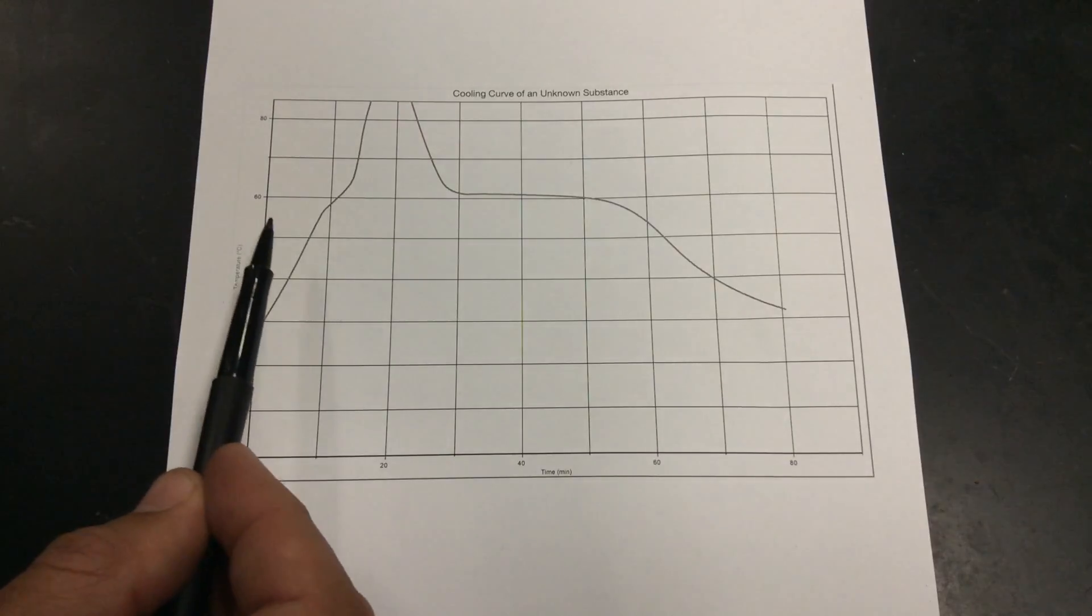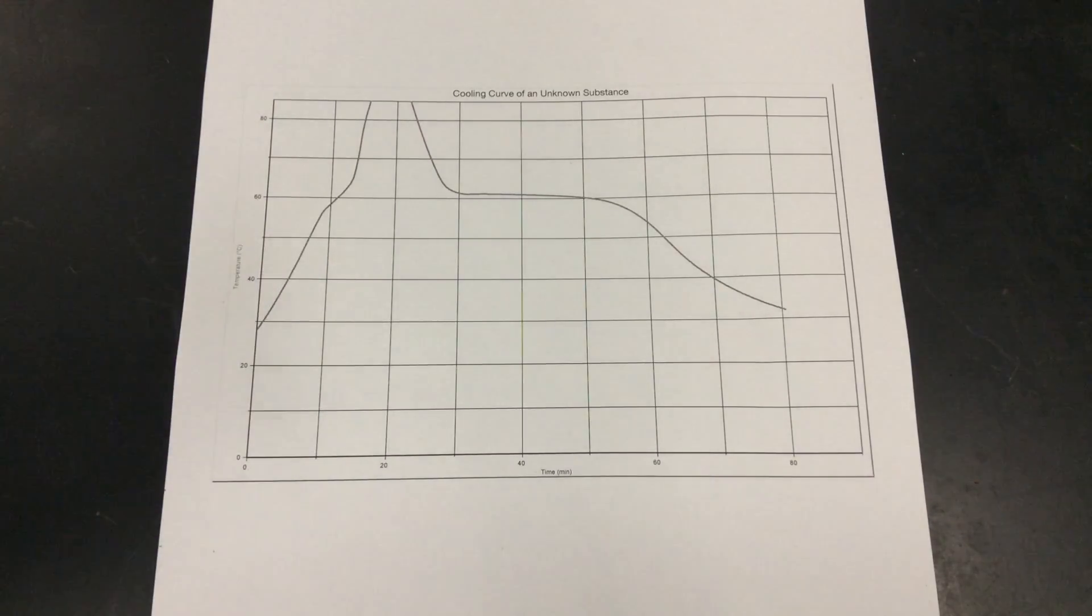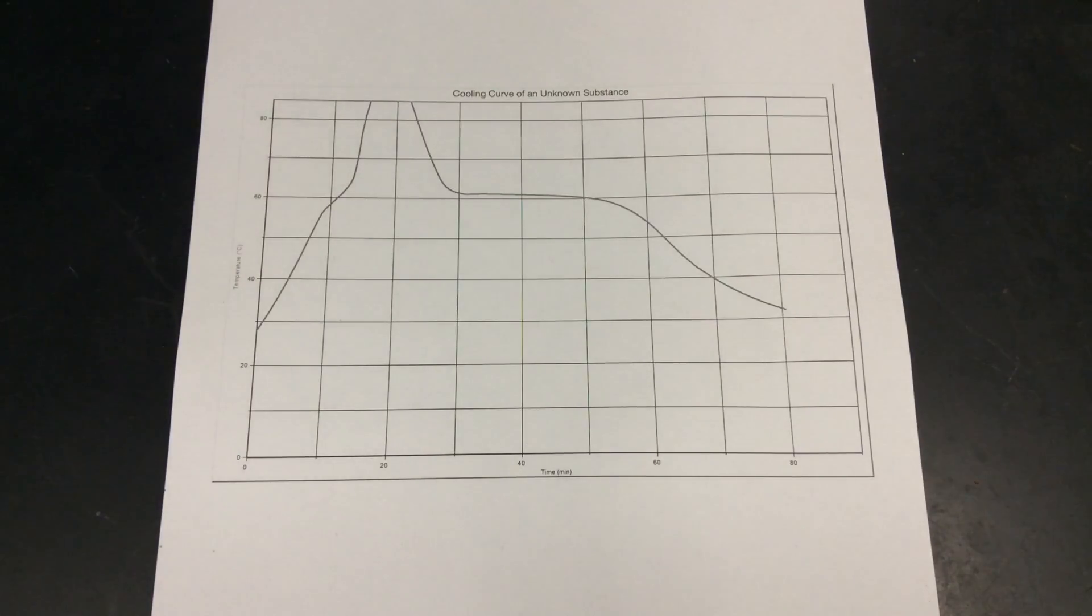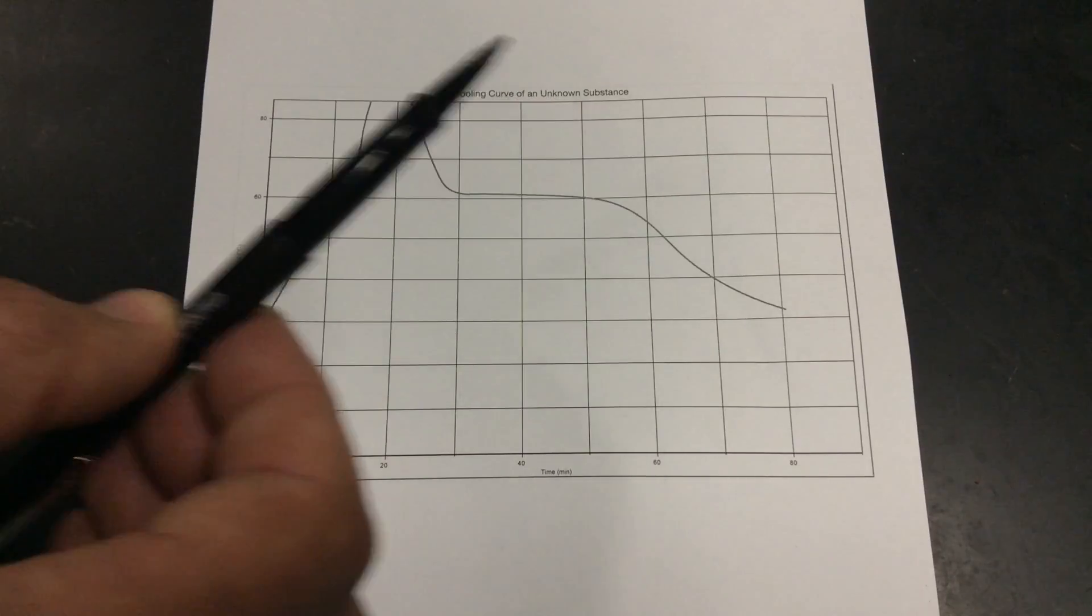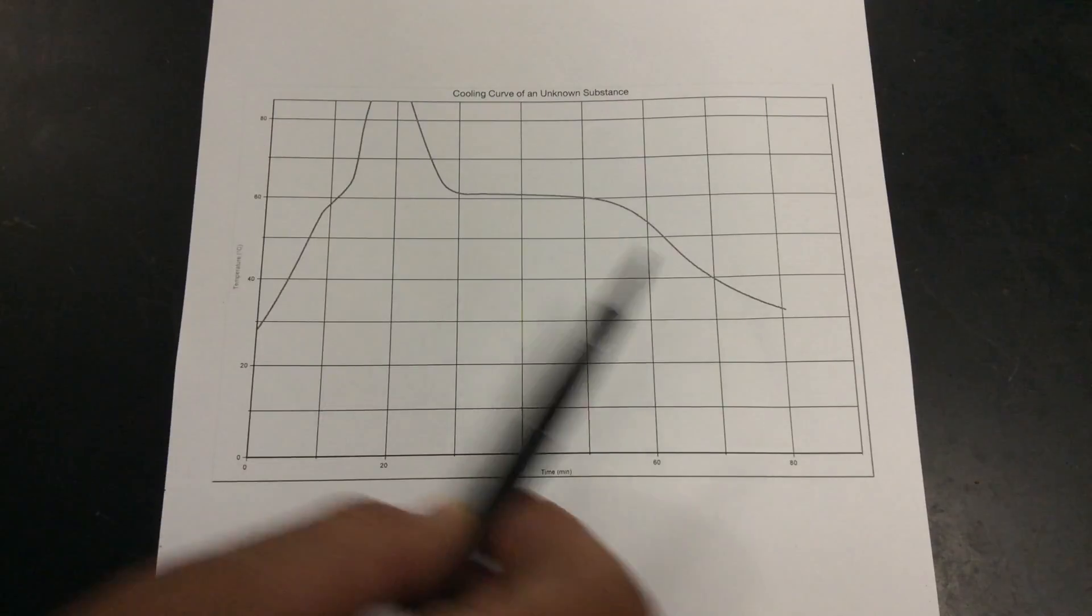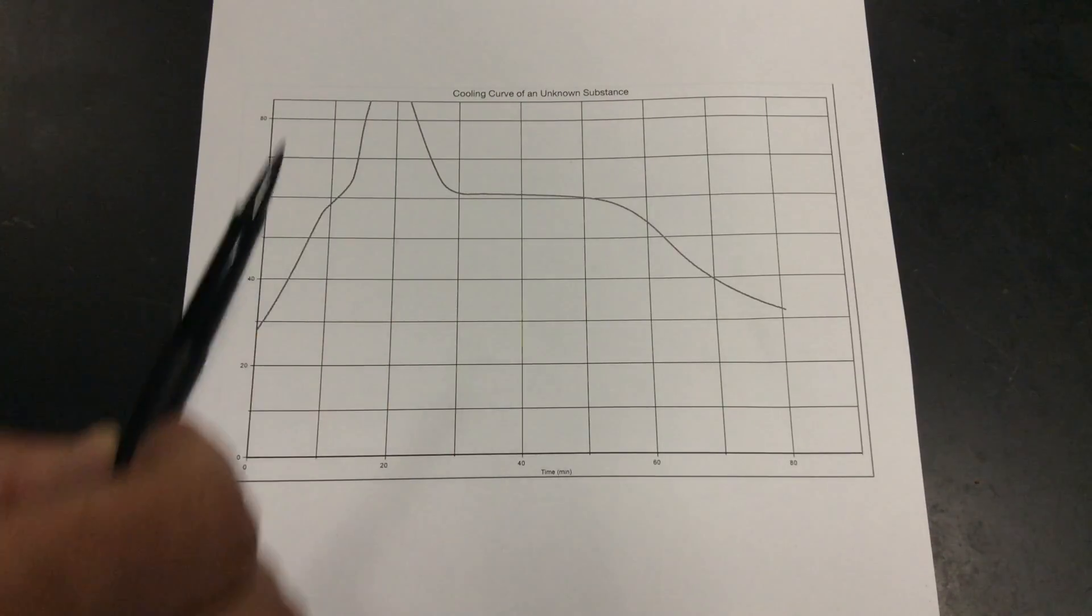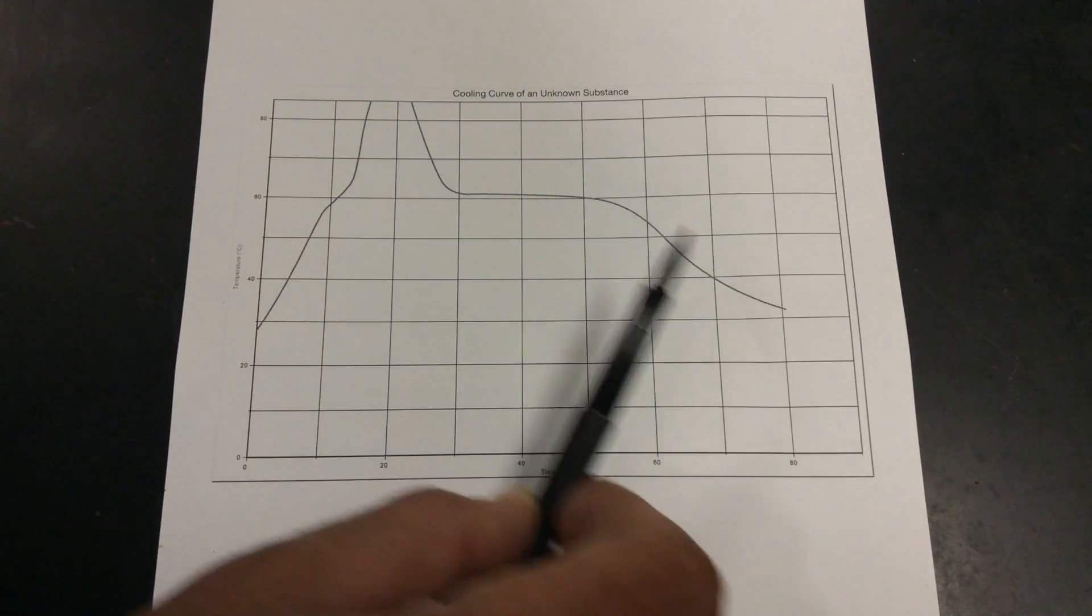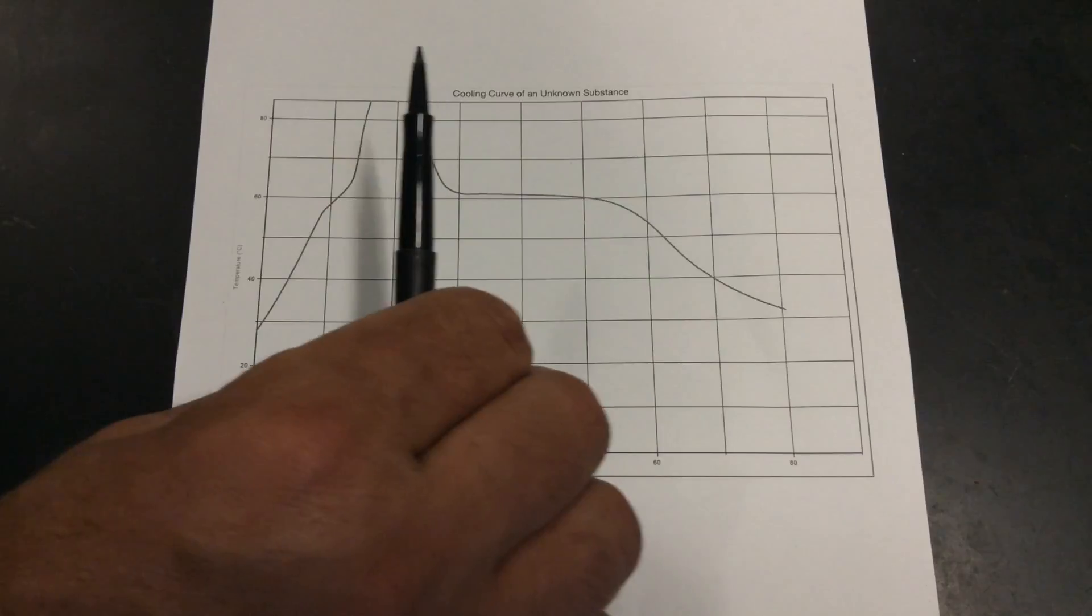As you can see, there's not a lot of calibration in between these lines here. The best way to do this is take the data table. We're going to mark this graph up. I want solid, liquid and I want the phase changes marked in all parts of this graph, even on the part where it's not as clear. You still can get some hints here. This is kind of reinforcing, this side is reinforcing what this side means.